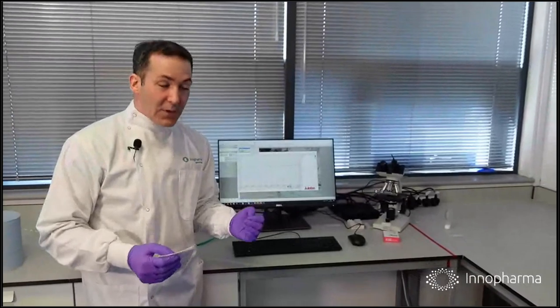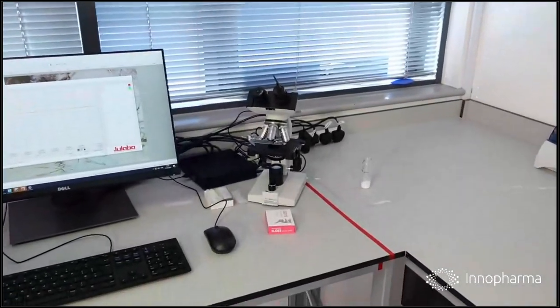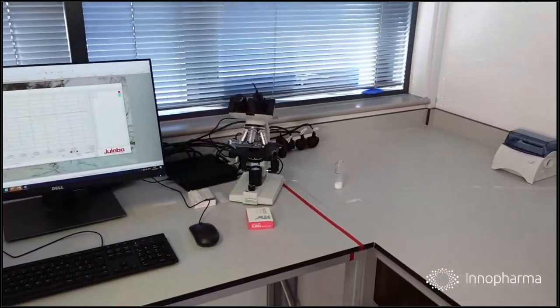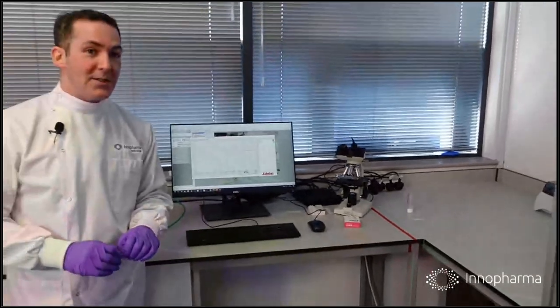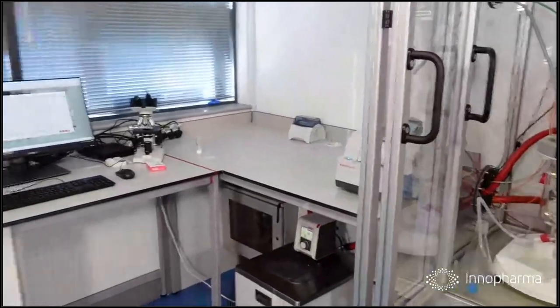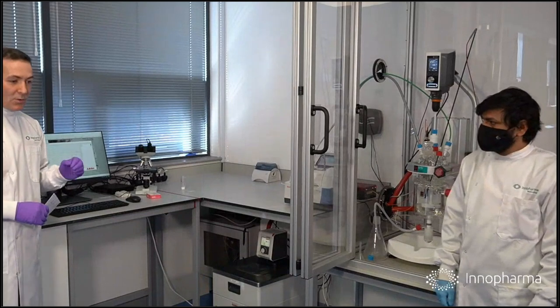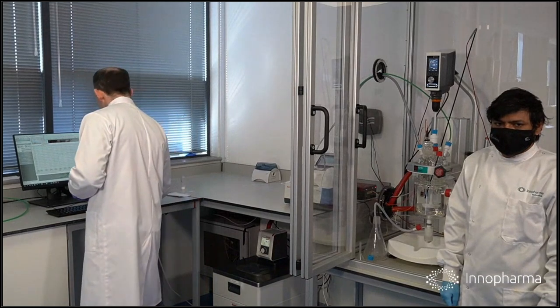Also here in the lab, one of the instruments that we'll be using is a simple microscope. We want to show you some of the advantages, if only by showing you how time-consuming and laborious the existing analytical technologies are, and we want to use that to demonstrate some of the advantages of using inline measurements. So what I'd like to do now is to show you some of what that microscope is seeing, how those crystals look under the microscope.